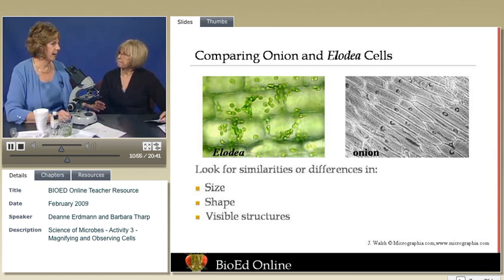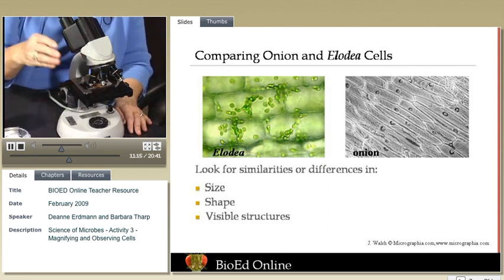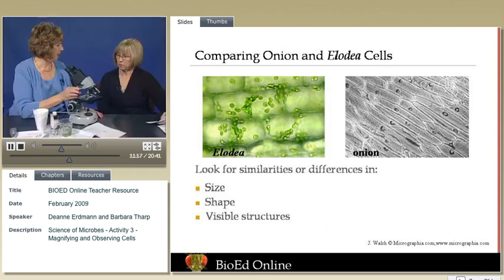If they don't even recognize that they're supposed to be looking for something that's sort of oblong and rectangular, and they found something that's totally irregular and crumpled up looking, then they're not in the right area. And that's why we had the pictures to begin with, because they need to know what they're looking for to begin with, right?